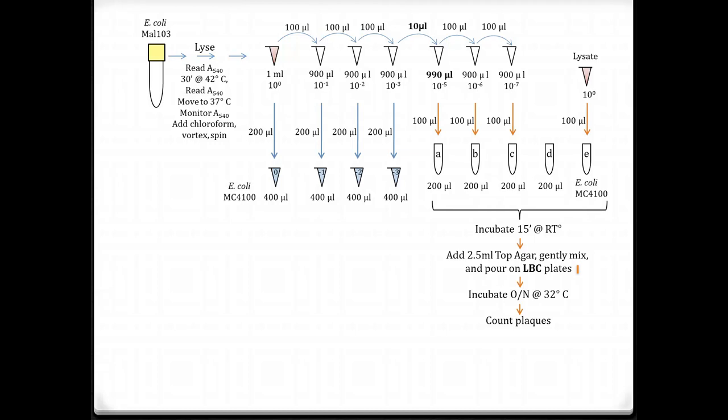And that's because we're going to be looking for inserts that happen anywhere in the genome. Those are the LacMac plates. That's one set of experiments. And then there's a different set of experiments where we're asking for inserts that happen specifically in the arabinose operon. Don't confuse those two things. A lot of people think all we care about is the arabinose operon in this experiment. It's not true. Okay? All right.